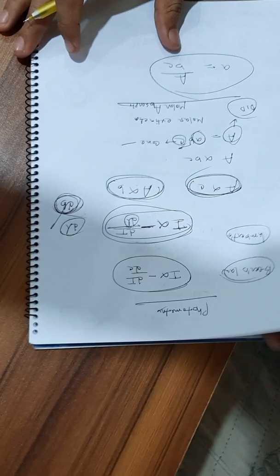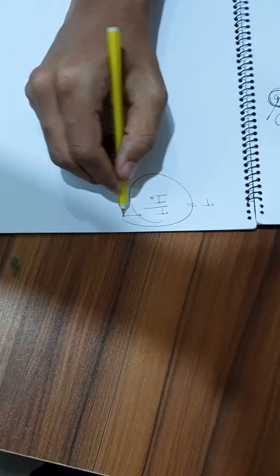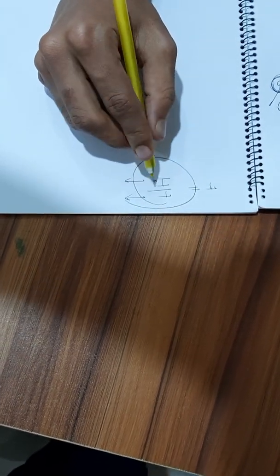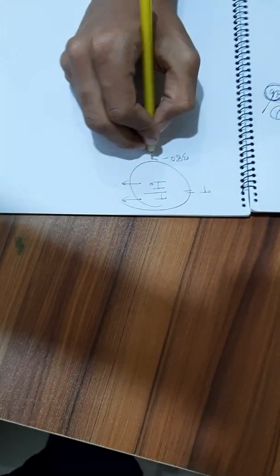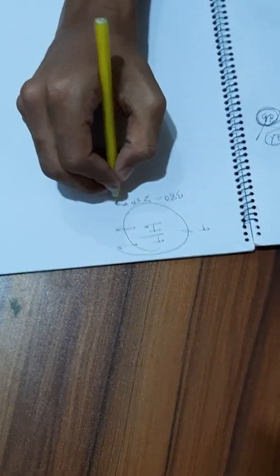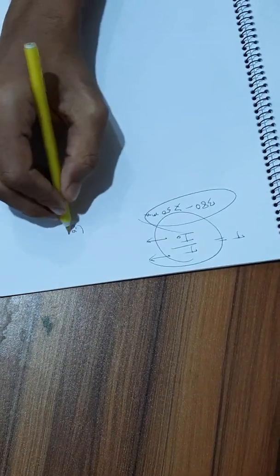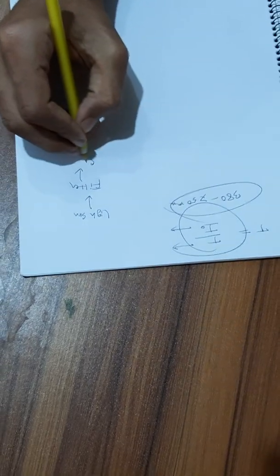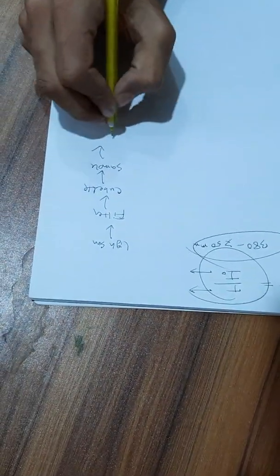Now transmittance. What is transmittance? Transmittance is the ratio between I and I naught. I means transmitted light intensity and I naught means incident light intensity. Normally we can see light between 380 to 750 nanometer wavelength. From the light source it comes to the filter, then cuvette, then sample, then detector and display.